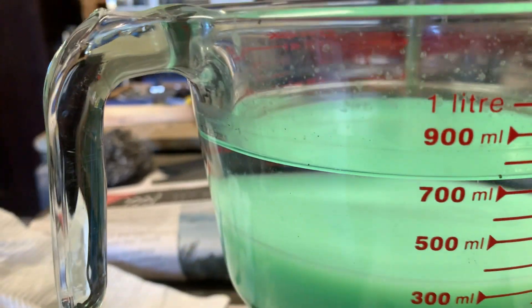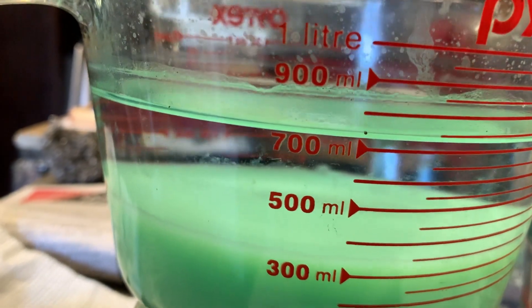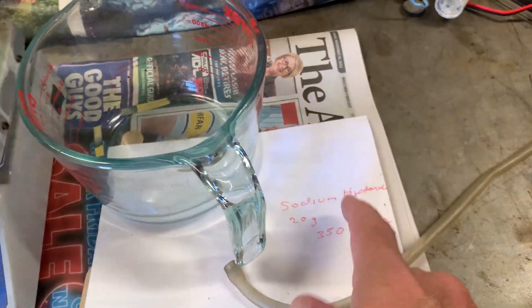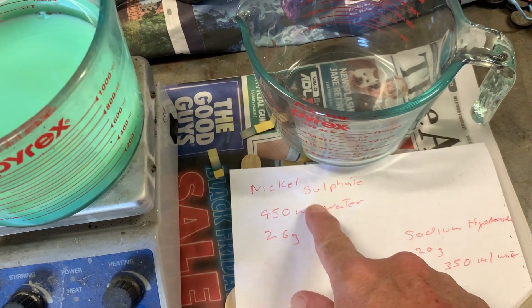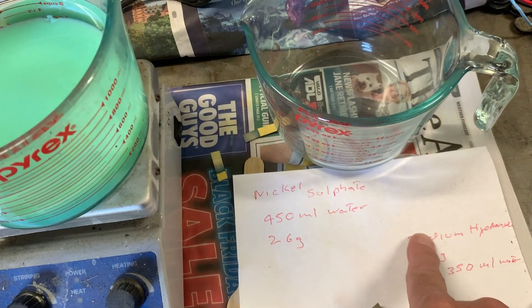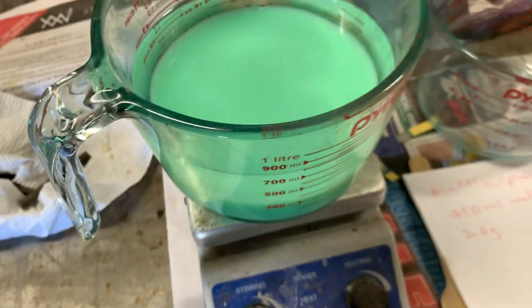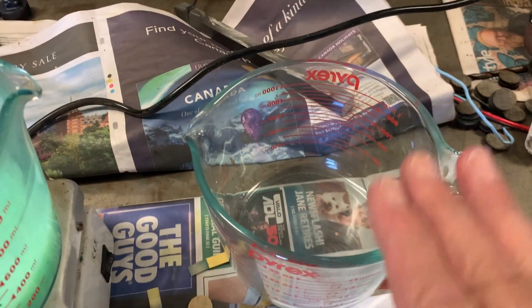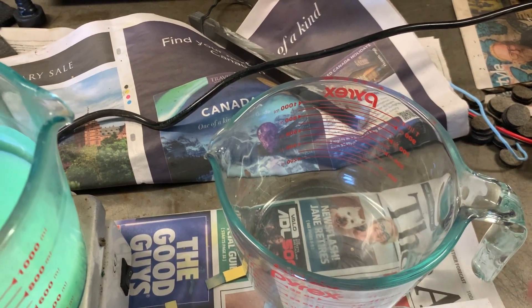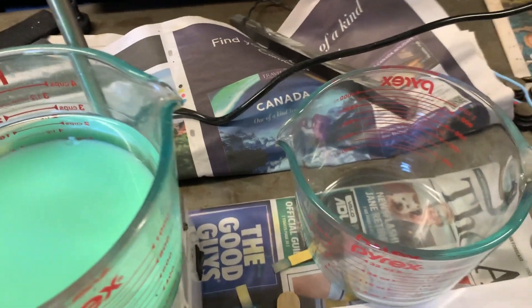The first liquid left after the first run should be sodium sulfate, because the sodium hydroxide and the nickel sulfate react — the sulfate binds with the sodium. But there's probably some nickel in there too, so it's best to leave it in a tub, let it evaporate, clean up the salts, bag them and dispose of them. Don't put it down the drain.